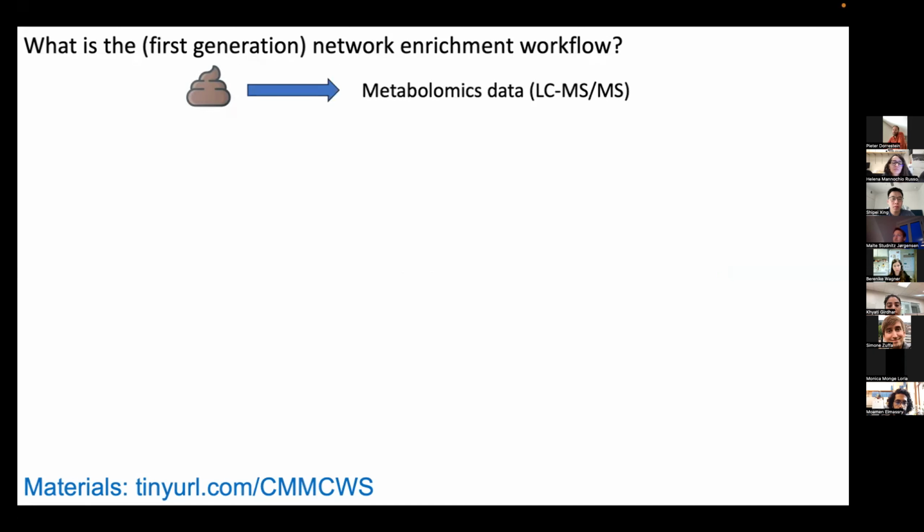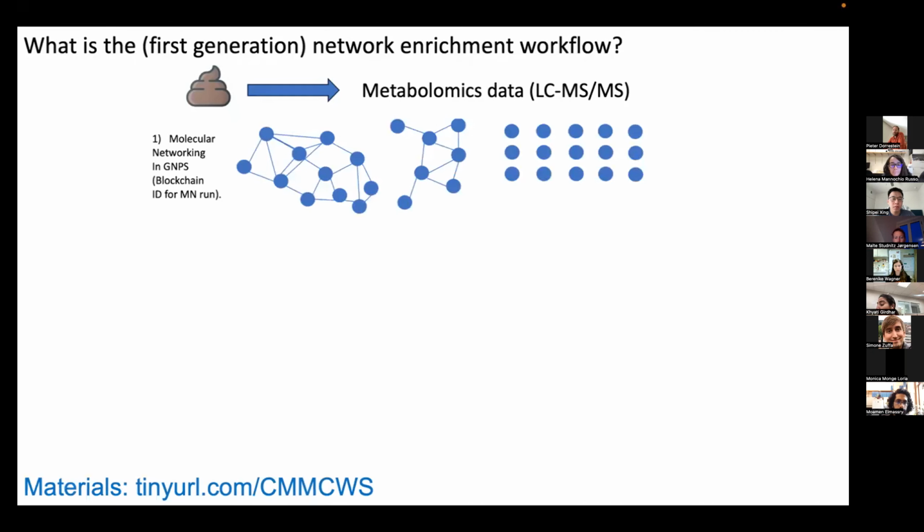The type of data that we're going to analyze here is metabolomics data based on liquid chromatography and MSMS of all the ions that are observed. So you fragment all the ions. And Elena will go a little bit deeper into what that data structure looks like. But then we can apply molecular networking. And basically with molecular networking you can get your relative intensities. You can get annotations from it if you match against spectral libraries. And at this point, the average annotation rate is 14%.